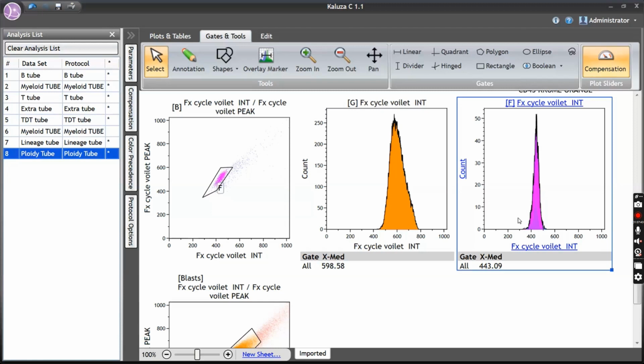If the blast falls in that range, I would call it diploid. When it is greater than 1.06, I'll call it hyperdiploid. When it is less than 0.98, I'll call it hypodiploid. So now you've got this intensity, divide the numerator by the denominator. 1.36 is the value we got, which is far above the normal diploid. So this is definitely a B-ALL with hyperdiploidy.